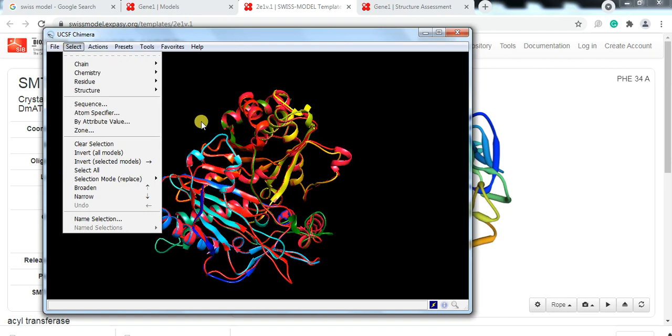So this is our video about homology modeling, how to do it and what homology modeling is. Hopefully it will help you.